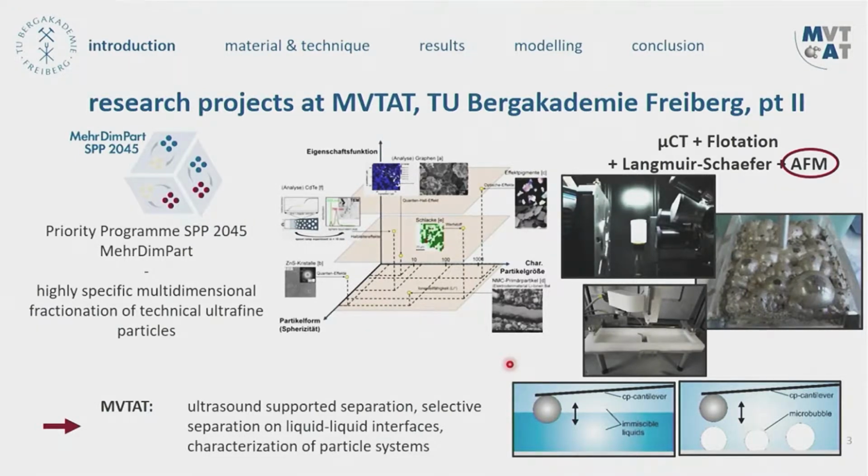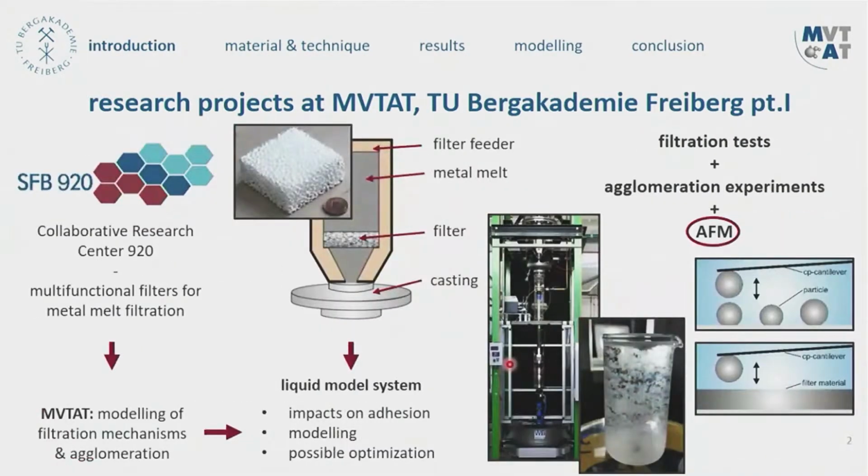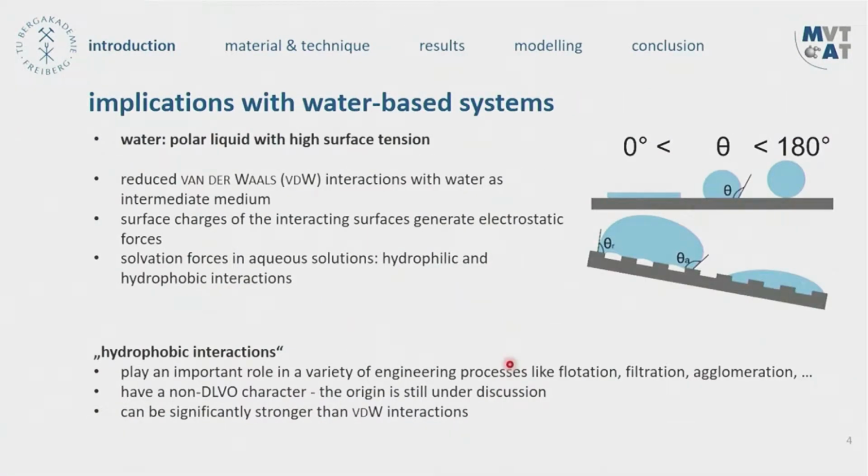So first of all, looking at the particles within liquids, to make them adhere to the surface, to make them stick to the surface, we need to know about the interaction forces. And we have a bunch of interaction forces in that surrounding. First of all, we are in the aqueous phase. We have van der Waals forces marked here. They are even reduced, influenced by the surrounding liquid. We have definitely electrostatic forces, and then we are with the DLVO theory, but further on we get some structuring of the water, adsorption layers on the surface. This is, let me say, the familiar bunch we have.